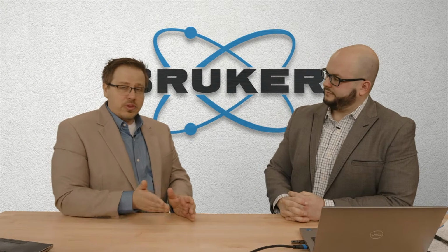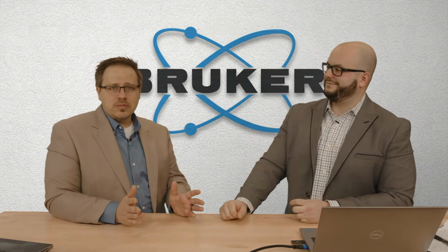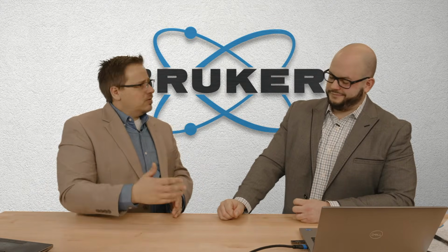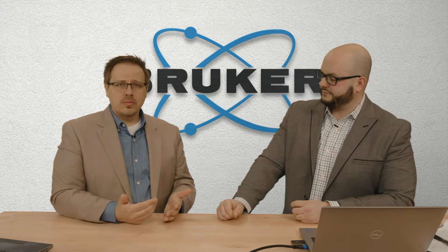And with that, doing it with the 1D method, that takes forever. You might be talking 30 minutes per spot. No, it's not too bad, but if you're doing 100 spots, that's a lot. Yeah. Generally, we're talking like 5-6 minutes per point for the full biaxial with shear.